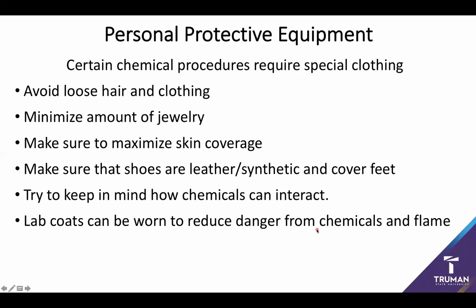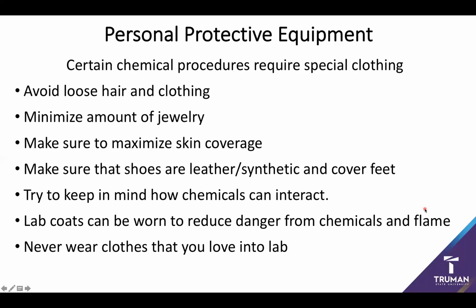They often form a shield against any sort of chemical exposure, but also very importantly, if a chemical spill, say, occurs and it is absorbed by, say, a cotton lab coat, one of the big things to remember about most lab coats is they're designed to be quickly removed so that you can quickly shed any sort of chemical exposure and remove yourself from harm. And similarly, in case it catches fire, it's much easier to, say, remove a lab coat than most clothing. But also they act as a protection barrier for whatever clothes you have.